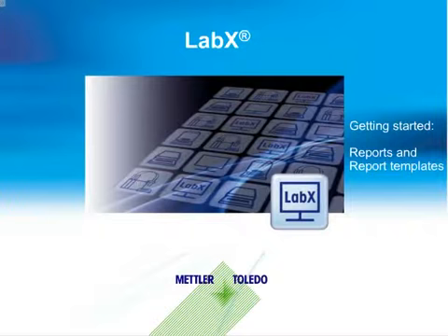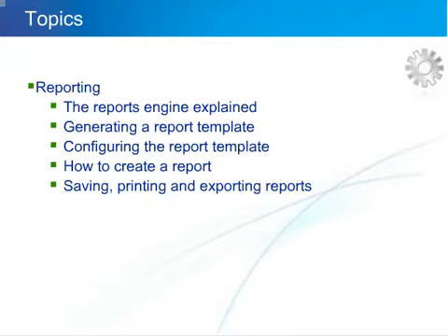Getting started. How to generate reports by utilizing the report templates. The focus for this lesson is to illustrate how you can create reports by using the new and very powerful LabX report engine. We will present a quick overview of the reports and report template concept, as well as demonstrate to you the main report engine functionalities. We will conclude by showing you some available options of how to print, store and export a report.